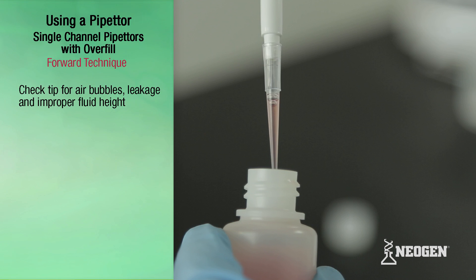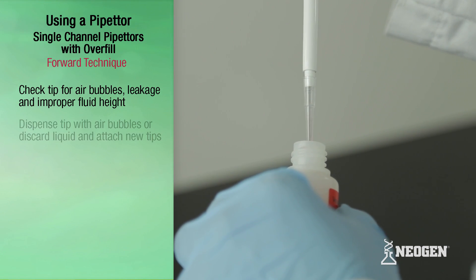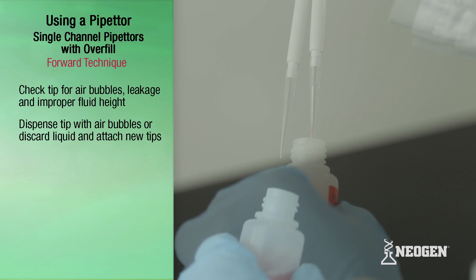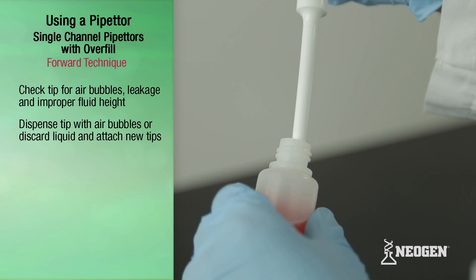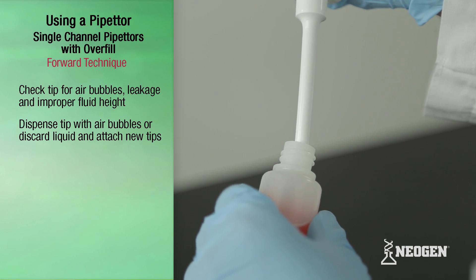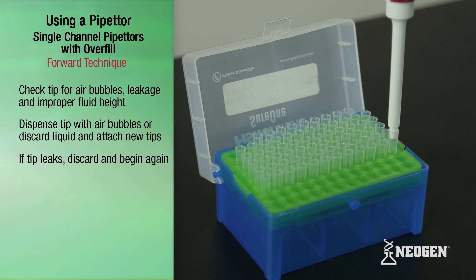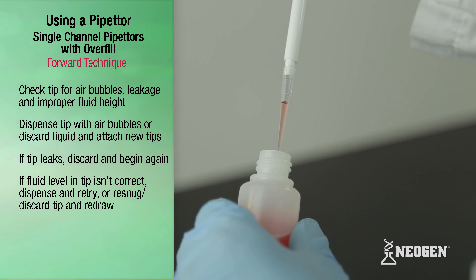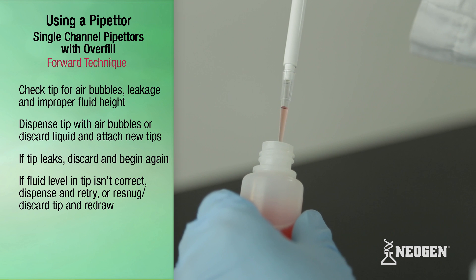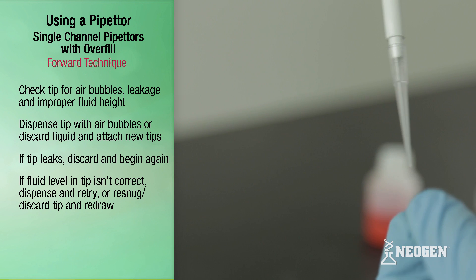Check the fluid in the tip for bubbles, leakage, and fluid height. If you see any bubbles, dispense and redraw the liquid following the procedure shown earlier, or discard the liquid and attach a new tip. If a tip is leaking, discard the tip, attach a new one, and begin again. If the liquid in the tip is not at the proper level, dispense the liquid back into the vessel, re-snug or discard the tip, attach a new one, and redraw.